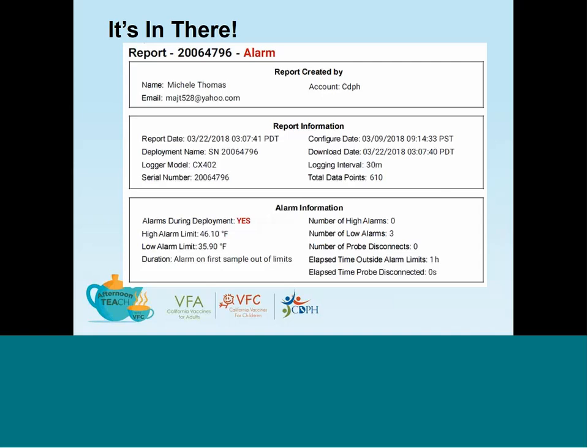The first thing that stands out for me with this particular report that we're reviewing is the word alarm in red, indicating that there's an out-of-range temperature that was recorded. When I review the first box, I can see which staff person created this particular report.